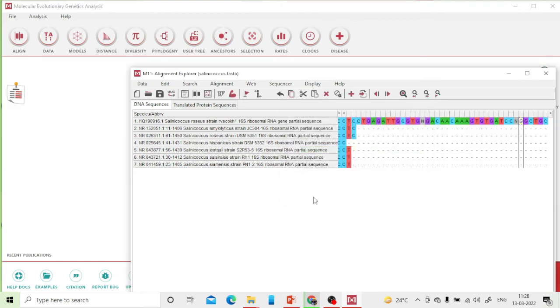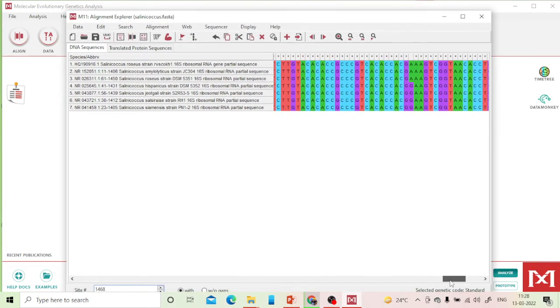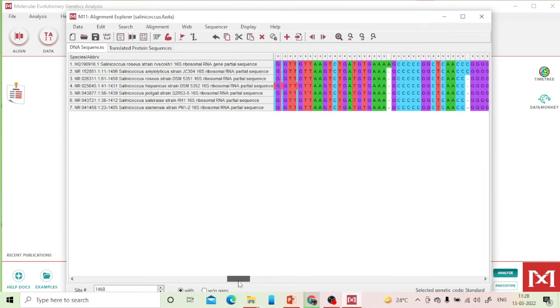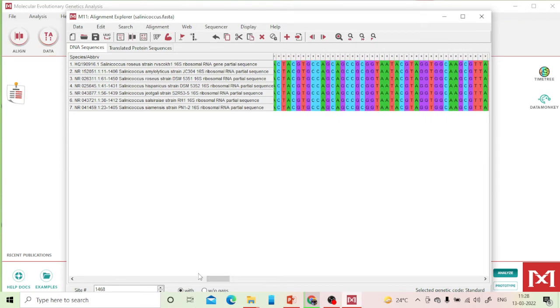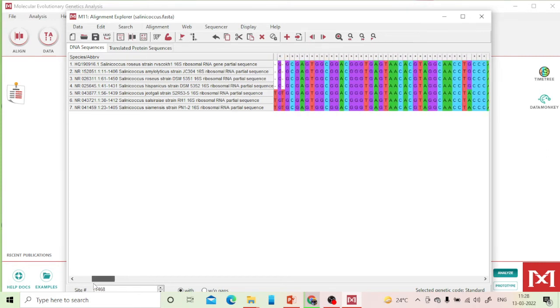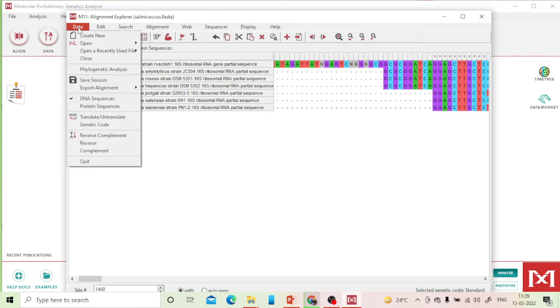With seven sequences, I quickly got the multiple sequence alignment results. Scrolling through, wherever a star appears, that column is 100% conserved. As I mentioned earlier, strong similarity means maximum parsimony is recommended. I can see conservation at the start and differences only at the ends, so maximum parsimony is a great choice. Let me export this alignment in MEGA format.